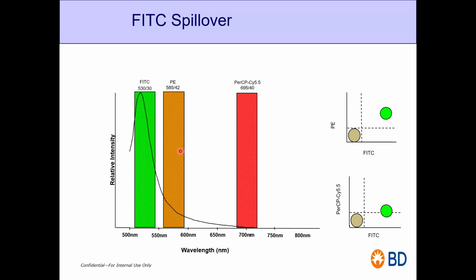Because of the spillover issue. And this shouldn't be the case. For example, if it would be a CD19, it would be a CD3, then as you know the biology, there are no cells so far found that are both CD3 and CD19 positive. It can't happen, right? So it means there is something wrong. And what is wrong? It's the spillover issue.